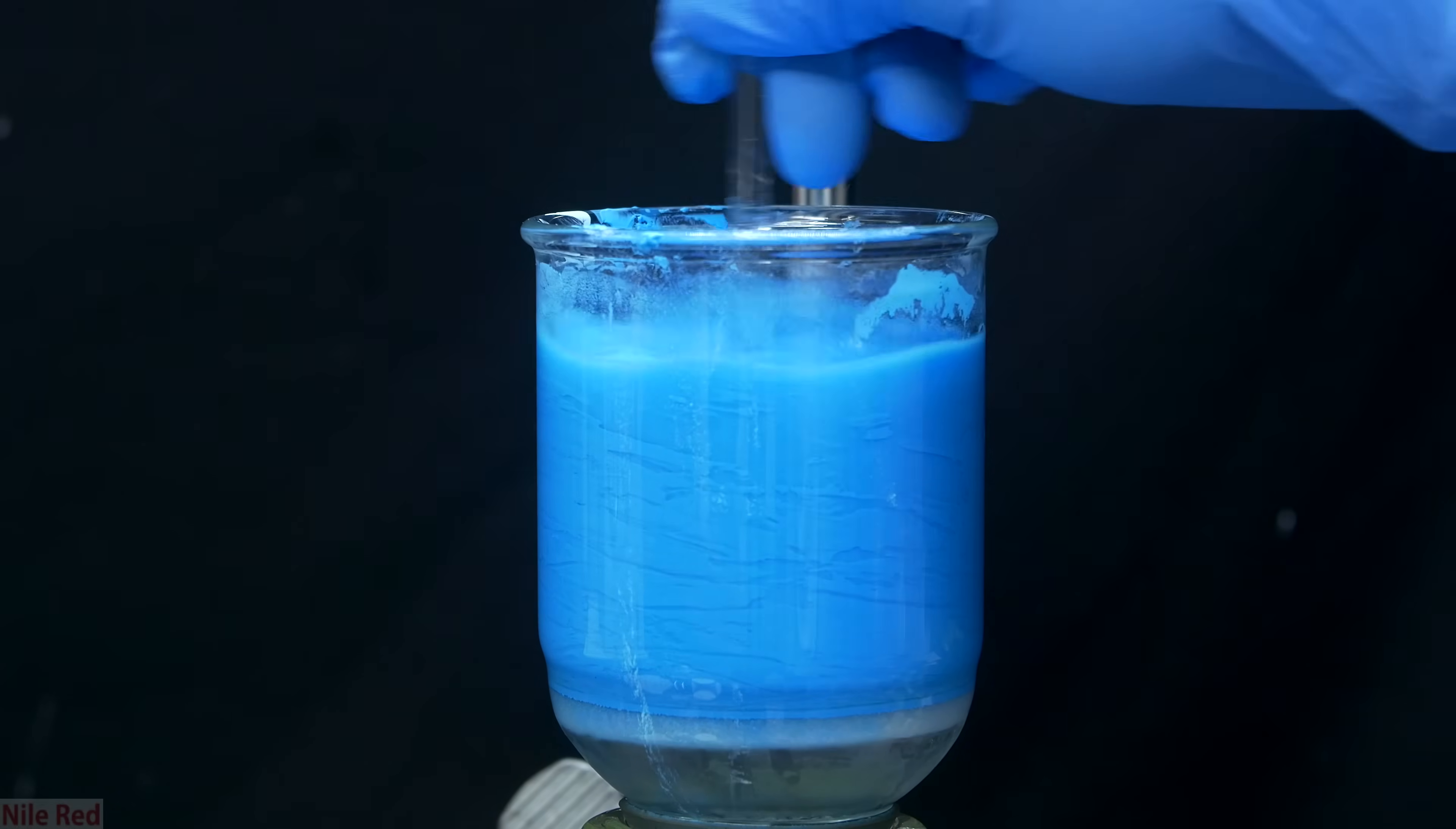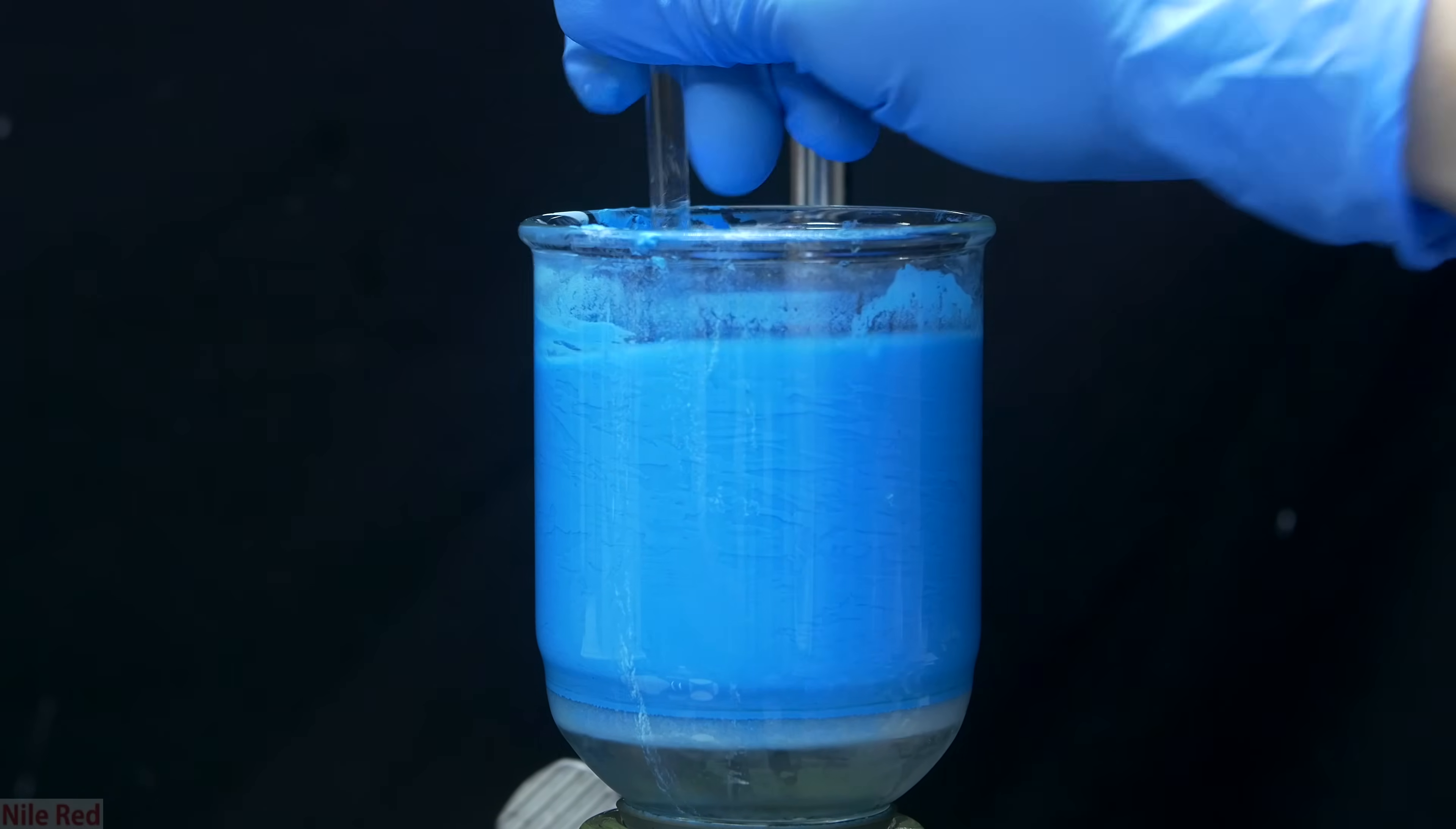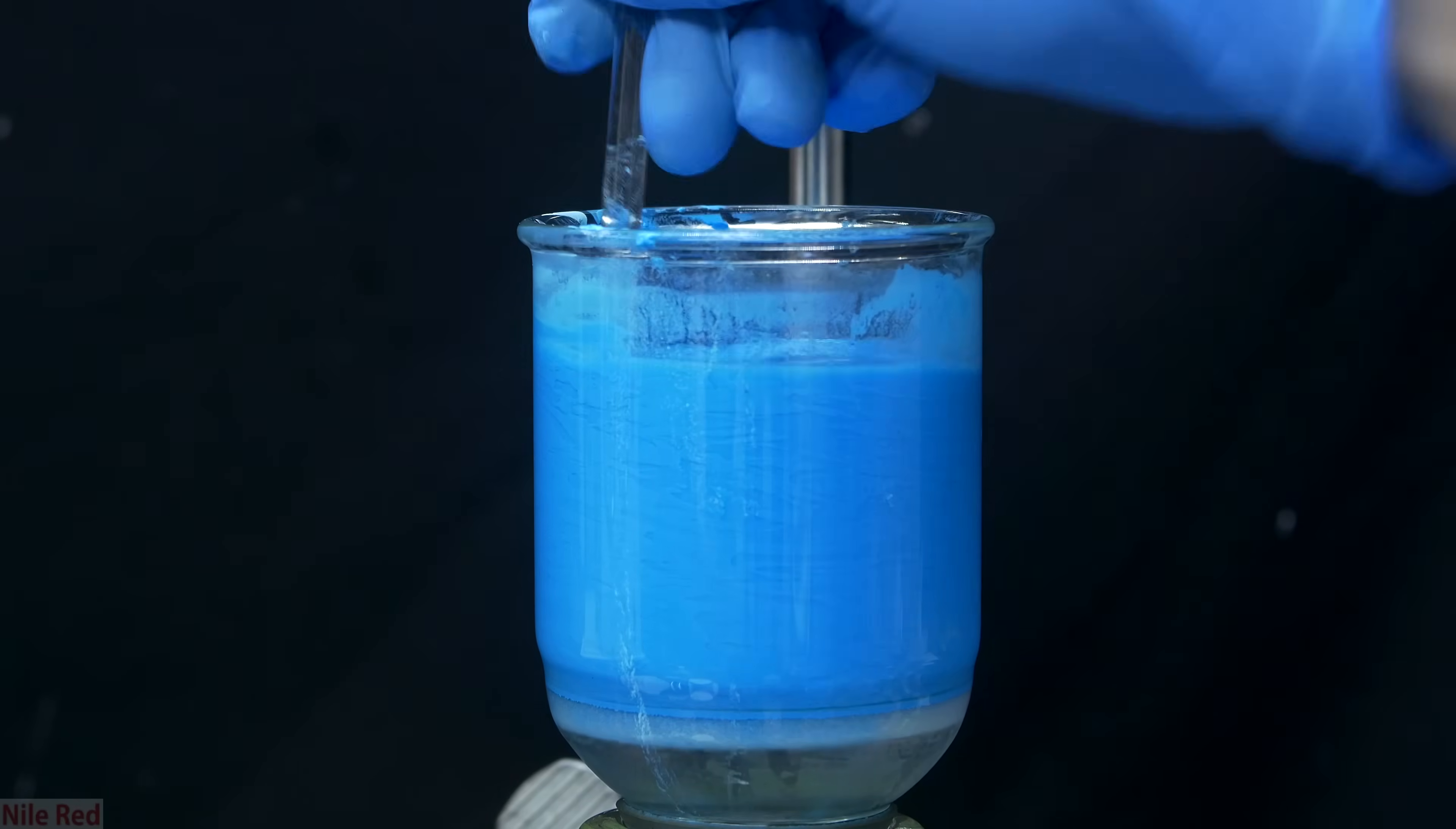With each acetone washing, I used a glass stir rod to stir the copper hydroxide around, and make sure that I break up any large chunks. When I was satisfied that there were no large chunks, I pulled the vacuum and removed all of the acetone. I then added more acetone, and repeated the process of breaking up any large chunks, and in total the washing steps were repeated two or three times.